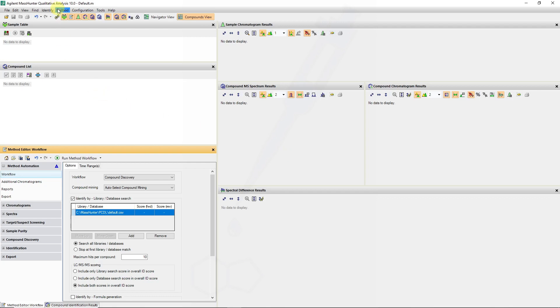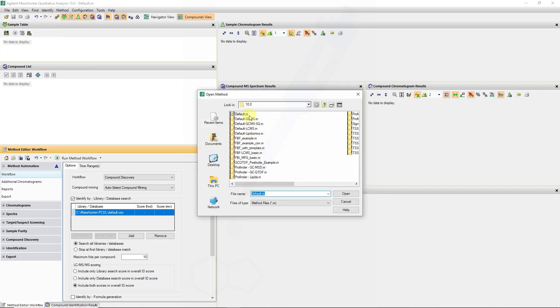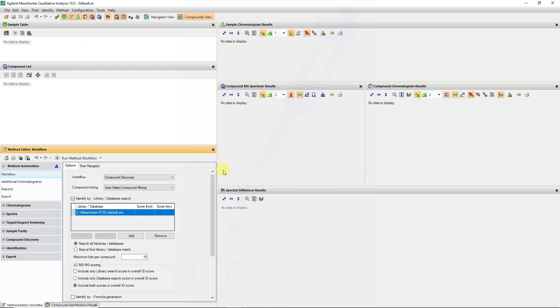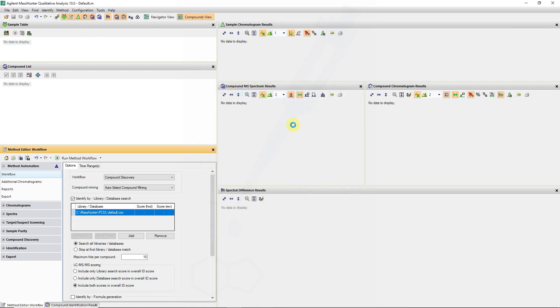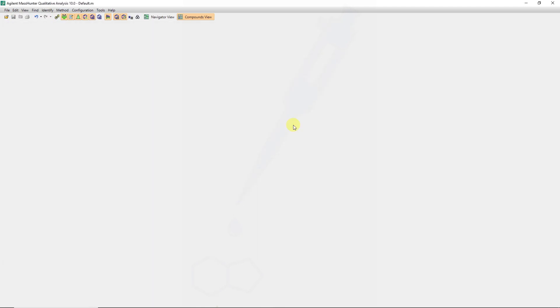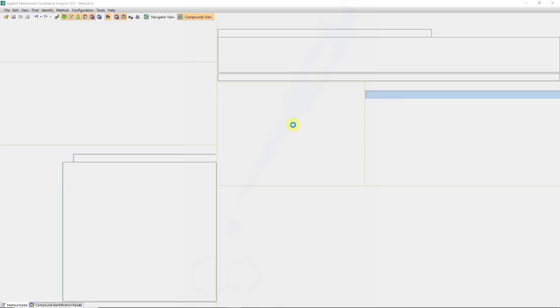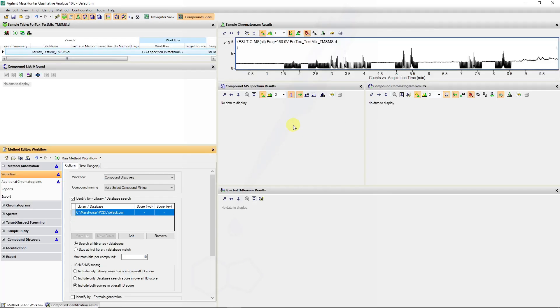For this I'm loading my default method again just to ensure that all the parameters are reset. I will open my target MS-MS data file which I showed you how we can create an inclusion list and add that to acquisition to generate this targeted MS-MS data file.